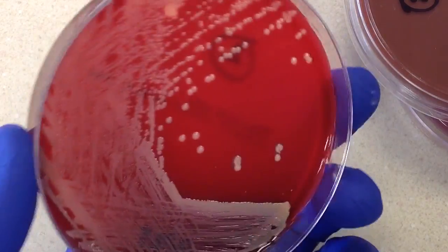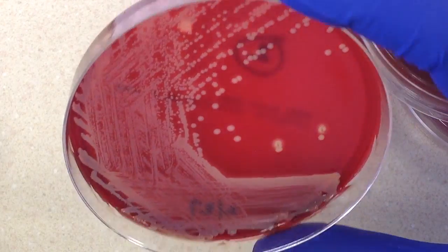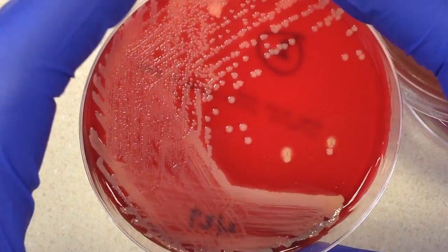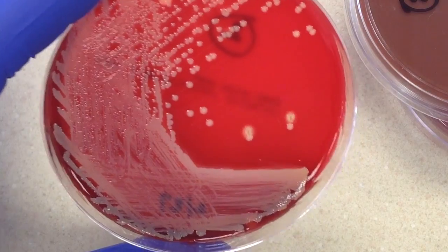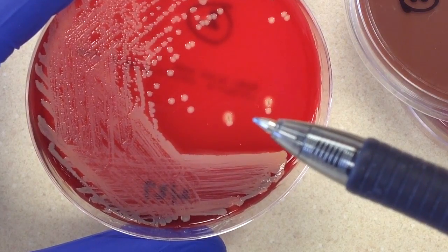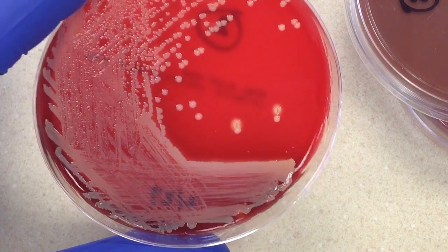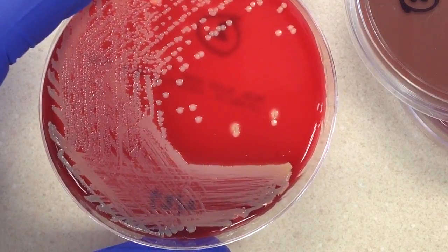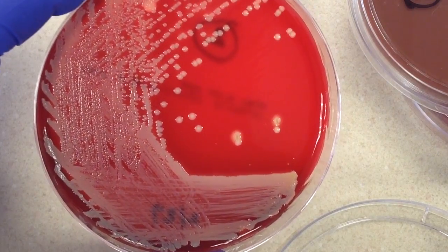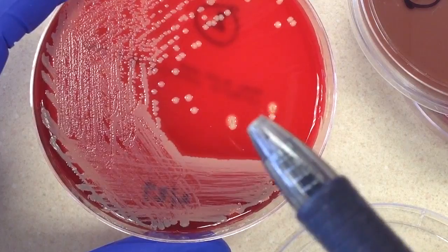Whenever we have a sheep blood plate, one of the things we always have to do is look for hemolysis. We tilt the plate with a light source coming from behind and look at the colonies for beta hemolysis. There isn't much hemolysis around the colonies, but whenever a sheep blood plate is set up, it's always stabbed with the loop during inoculation. We can see there is some hemolysis in that stab — that pertains more to beta hemolytic streptococci. I can see some beta hemolysis around that stab.